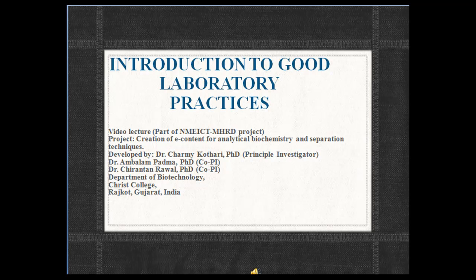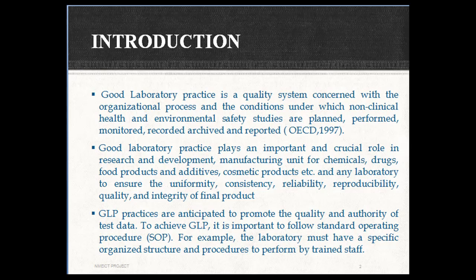Introduction to Good Laboratory Practice. Good laboratory practice is a quality system concerned with the organizational process and the conditions under which non-clinical health and environmental safety studies are planned, performed, monitored, recorded, archived, and reported. Good laboratory practice plays an important and crucial role in research and development.